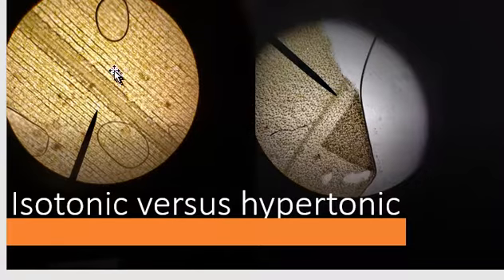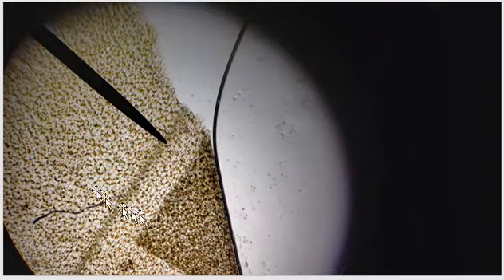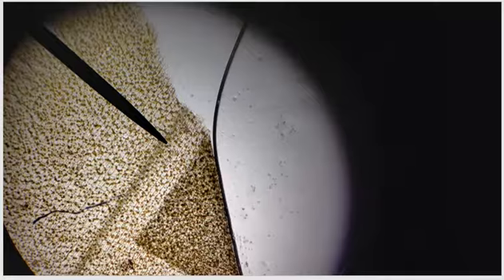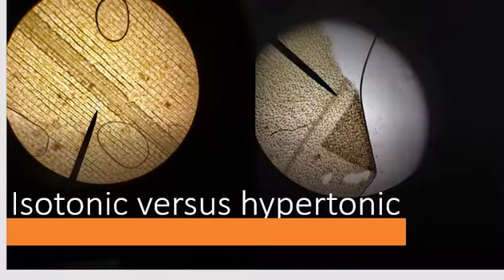So look one more time, and you can see the cells here, and you really can't see the cells that great here, but you can definitely see the punctate, very dotted appearance of the chloroplasts as they are clumped together. Now this one, you can see the actual individual cells. If you look real close here, you can see that they're kind of long and rectangular. Isotonic versus hypertonic.